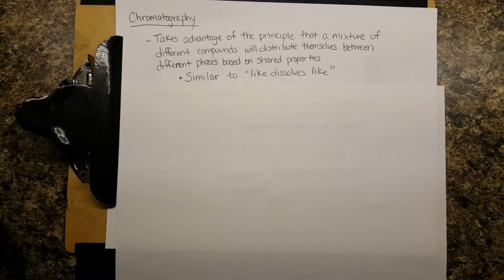And I'll talk about what the stationary phase is in a minute. But if you have something that's nonpolar in a polar environment, it's not really going to want to stick around. So it's going to try to move away from the polar resin or whatever your stationary phase is, whatever thing you're using to separate the different compounds in your solution.